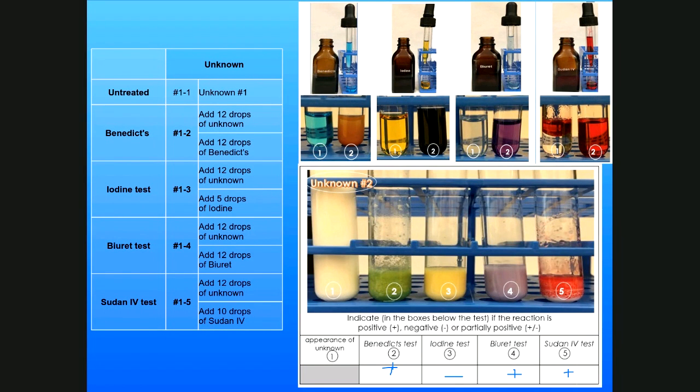And remember that all monosaccharides and some disaccharides are reducing sugars. It looks like it has. So this looks like it's a pretty complete kind of nutrient. It's got a lot of things in it.